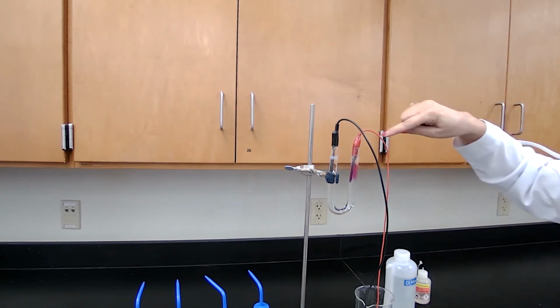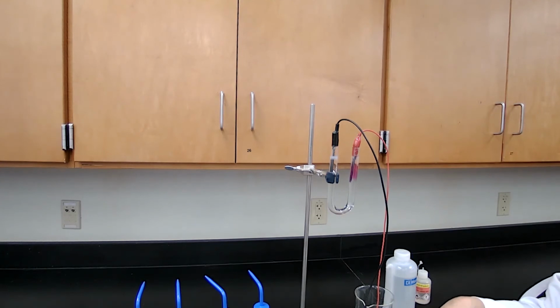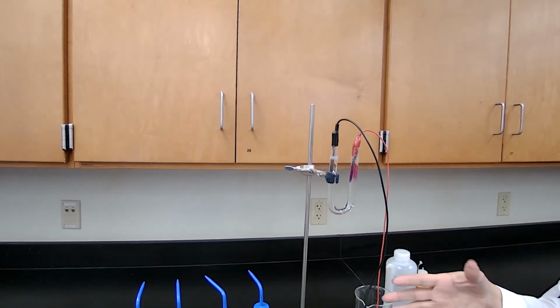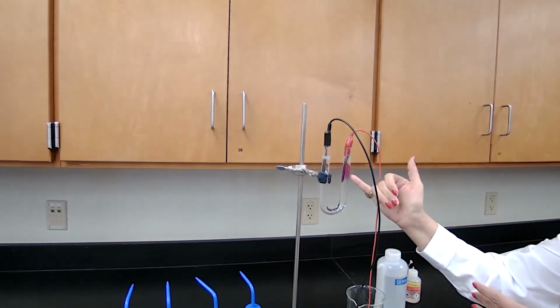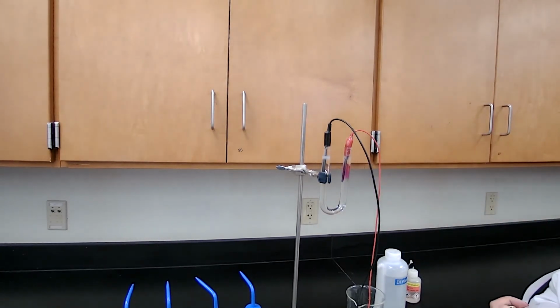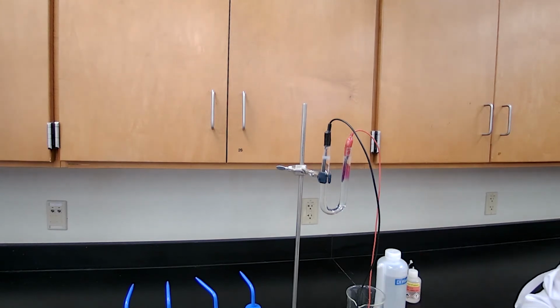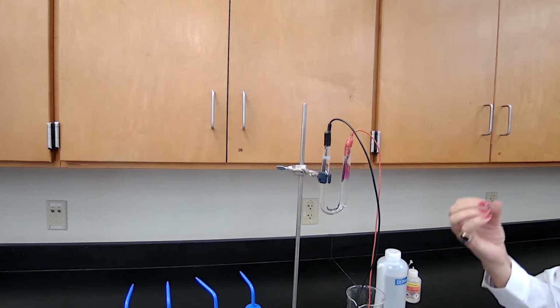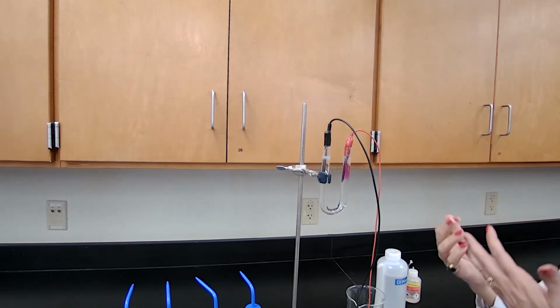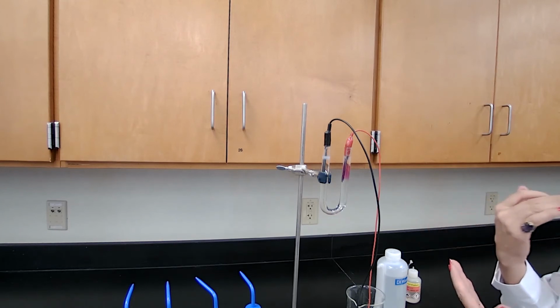Now, on the other side, bromide ion is going to be oxidized, because the other choice that we have is water. Since water is being reduced, we don't have to worry about water being oxidized. So bromide is going to be oxidized. When bromide oxidizes, it gives us a yellow-green color. It is not as colorful as the iodine, but it shows a little better than the chlorine.